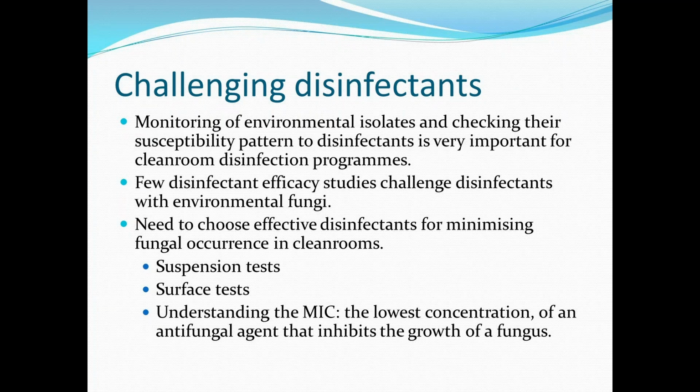There's also a way to assess this by determining the minimum inhibitory concentration of the disinfectant. That's more of an applied research tool, but it can also help in working out what the lowest concentration of a disinfectant is that can exert fungistatic or fungicidal properties.